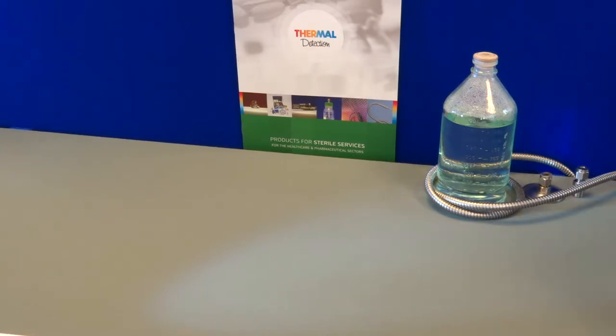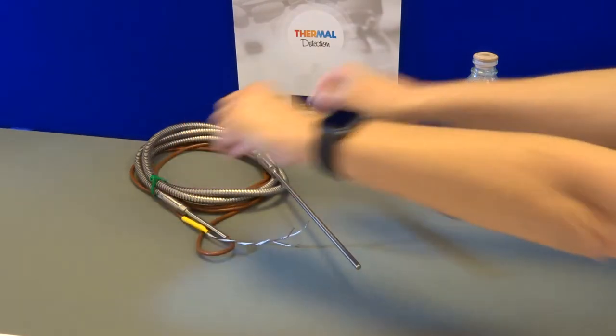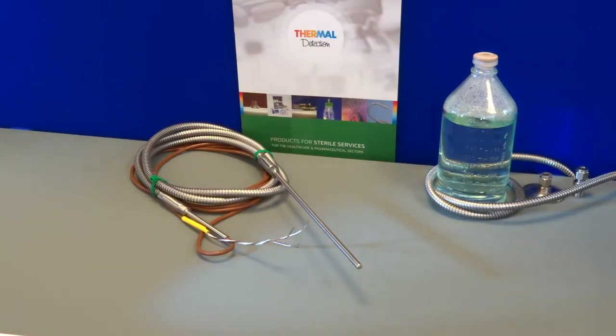Welcome to Thermal Detection's product videos. Today I'm demonstrating the Steriprobe autoclave chamber probe, which has been designed and manufactured by Thermal Detection for use in pharmaceutical steam sterilizers. This is now specified by autoclave manufacturers and end users all over the world.